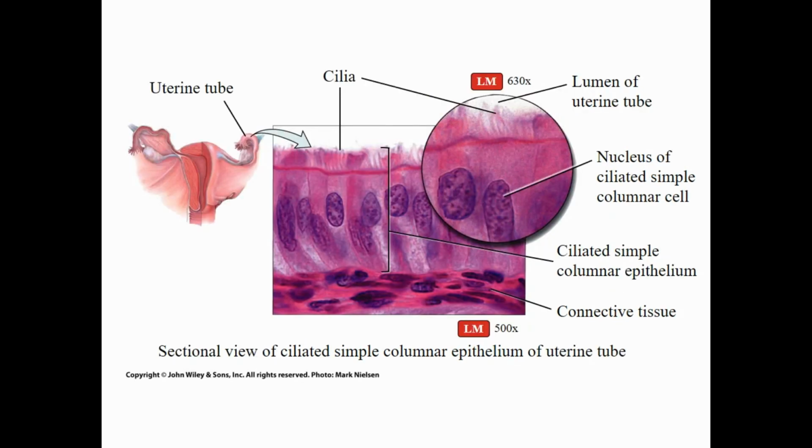Okay, here we have, again, connective tissue. So we're not looking at this epithelial. And we see they actually bracket it for us from here to here. This would be inside the fallopian tube. And this contains cilia, but this is definitely just one layer. It's not very confusing to see. The nuclei are all pretty well lined up. So this would be ciliated simple columnar epithelial tissue.